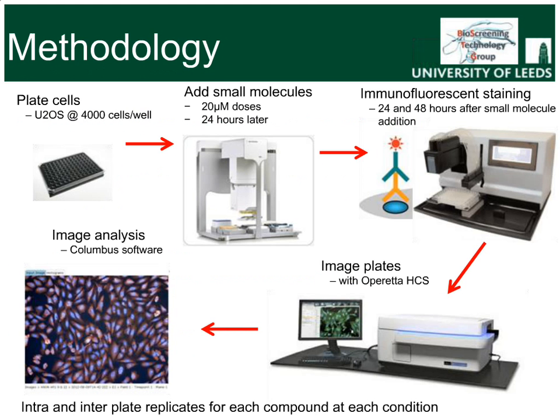This slide shows in more detail a flow-through of the experimental setup. The U2OS cells were plated 24 hours before the addition of the test library at a concentration of 20 micromolar using a liquid handling platform with 40 compounds added to each plate in duplicate.